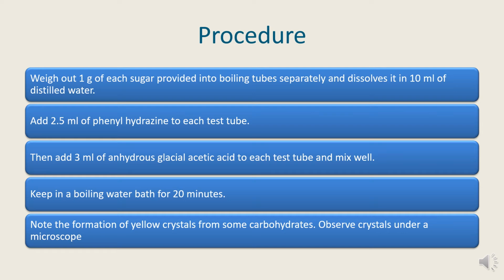Keep in a boiling water bath for 20 minutes. Note the formation of yellow crystals from some carbohydrates. Observe crystals under a microscope.